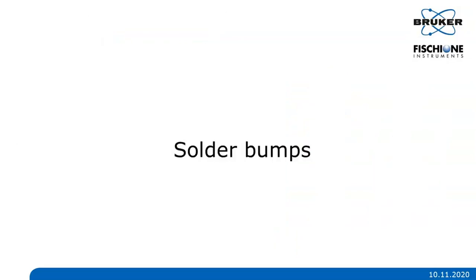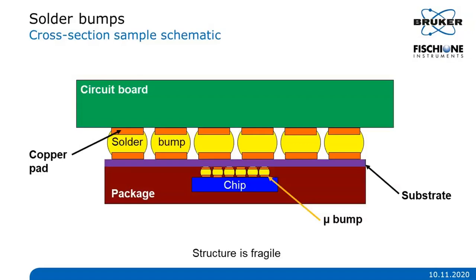And now we will proceed to one last challenging example with Pavel on solder bumps. So yes, the solder bumps are very challenging materials for sample preparation. This is because they are part of the semiconductor devices, and they are made basically from copper and tin alloys. As you can see here, both materials are very soft and have a very fragile structure.